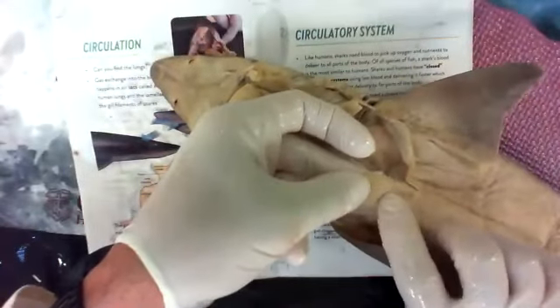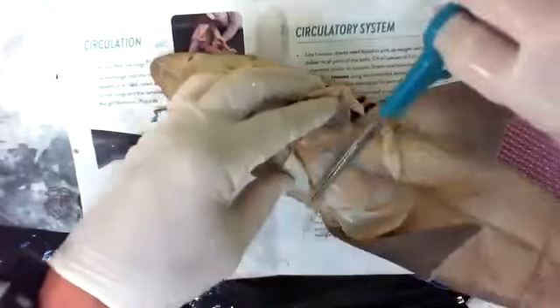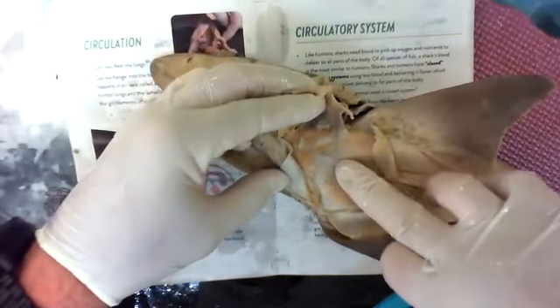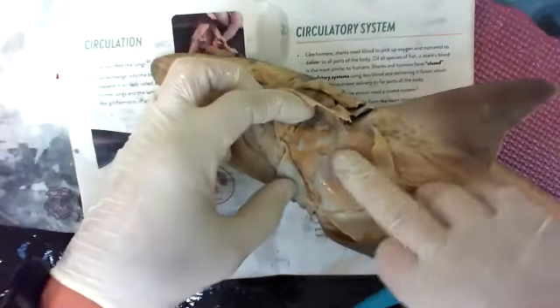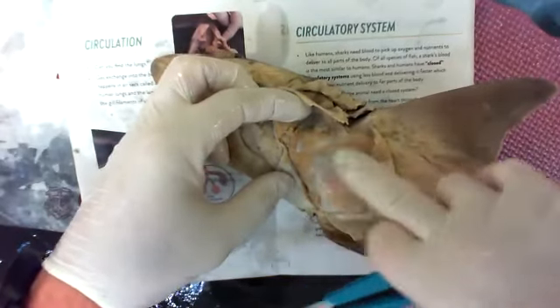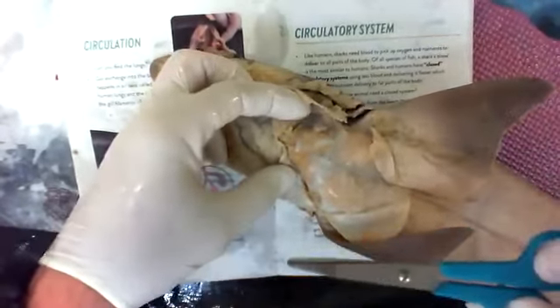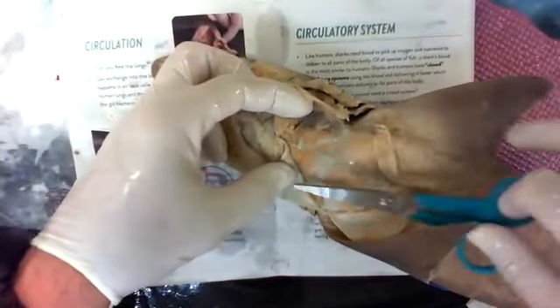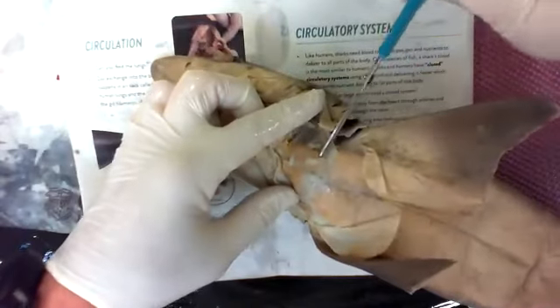And then you've got some nice sandpaper, right? You can polish up your rings. Very nice. All right, I've opened this up. I want to cut through the muscle. Aim high. If you feel here, it squishes in. Keep feeling, boom, there's a breastbone. It's not a bone, remember, it's cartilage, but this is the same as your sternum, which is the bone that goes in the center of your chest. We want to get back here where the heart's going to be. If we go down here, there's a good chance we'll hit the abdominal region. Just like on you, the bottom of your rib cage, below it's your abdomen. If you poked into there, you'd see guts, right? If you cut into a rib, which is above the bottom of the rib line, you'd see lungs and heart. That's what we're doing. We're shooting for above.